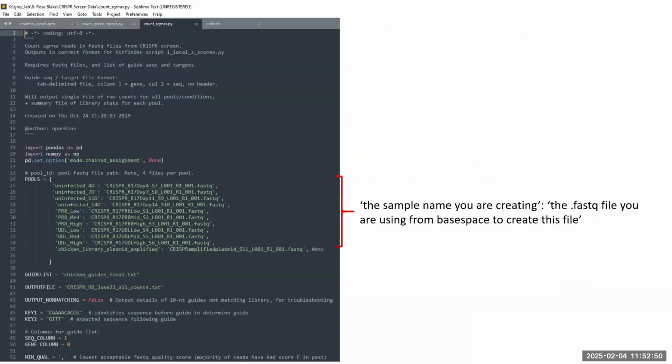Yeah, so this is a small part of the script that's in there, and you can look at the whole script if you want. The key parts that my postdoc is pointing out here are the bits that they change when they do each experiment. Leave most of the script the same. In green here, you're just putting in the names of the files. The reason you change this is because each time the file names are slightly different.